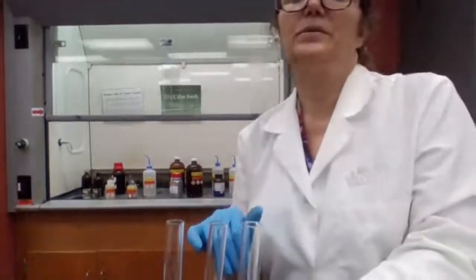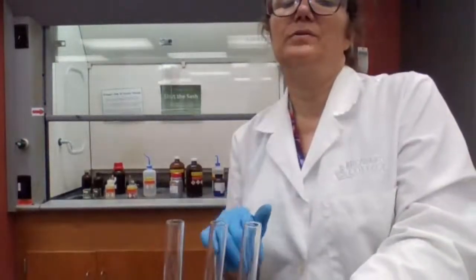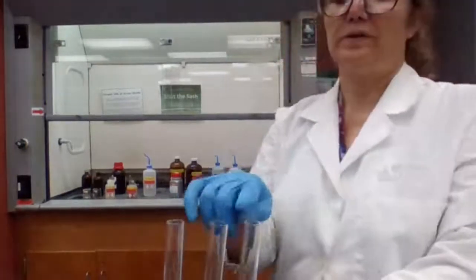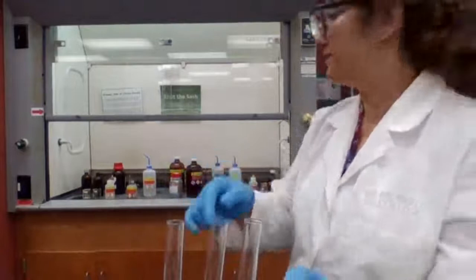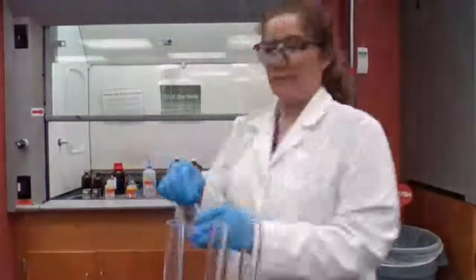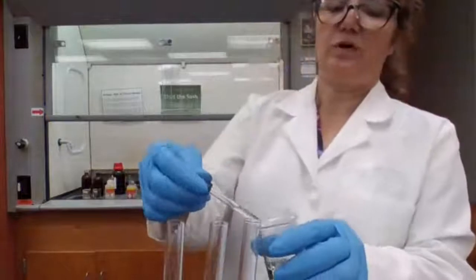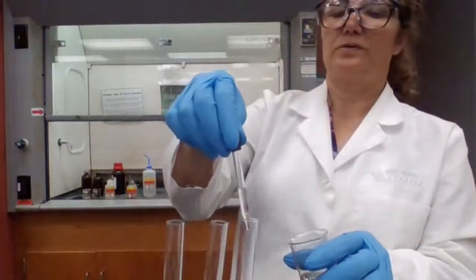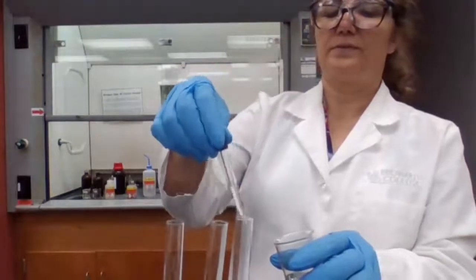And next, you want me to add 0.2 milliliter of amine to each one. So for primary, secondary, and tertiary, 4 drops. 1, 2, 3, 4 drops.